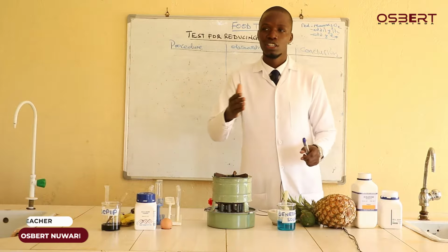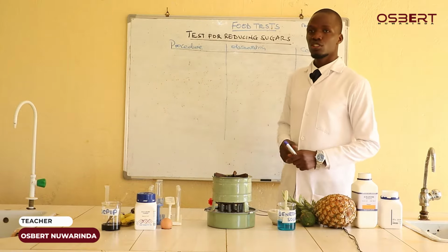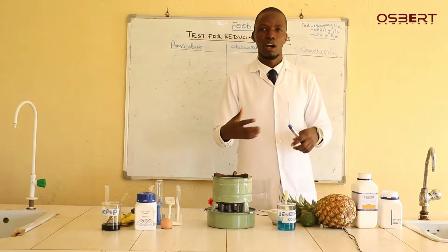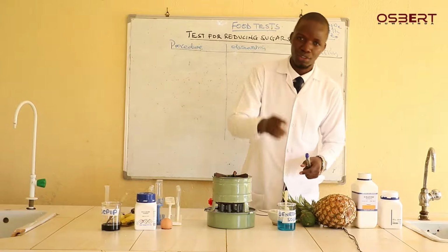Test for reducing sugars. After you have got the background in the previous video about why they are called reducing sugars and so on, how do we test for them?